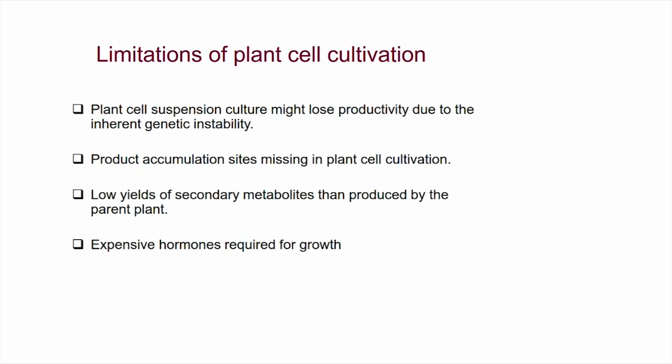Now, in order to avoid this, people exploited the agrobacterium mediated transformed cultures, especially the hairy root cultures. Why? Because they are organ cultures and heterologous expression can even be done. It will become more stable because there is genome integration of the tDNA into the plant chromosome. So, it is a more stable transformation event. And there is the other limitation in plant cell fermentations, you need hormones, but in hairy root cultures the cost will come down because they do not need hormones for growth.